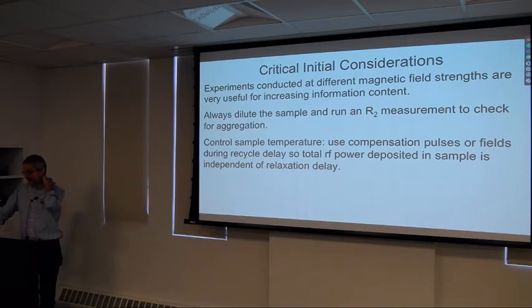And as you'll see in many of the experiments, as T increases, as the relaxation period increases, the number of radio frequency pulses or the length of spin lock CW RF pulses increases, and that means there's more deposition of RF energy into the sample and therefore potentially more heating of the sample.